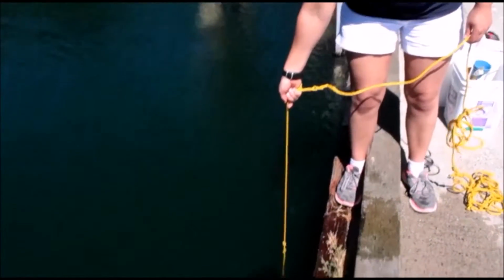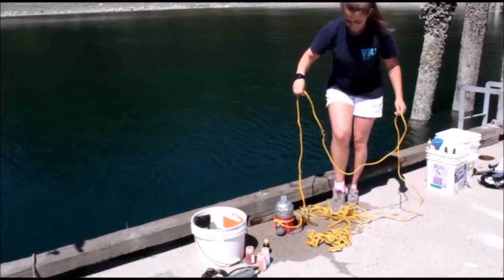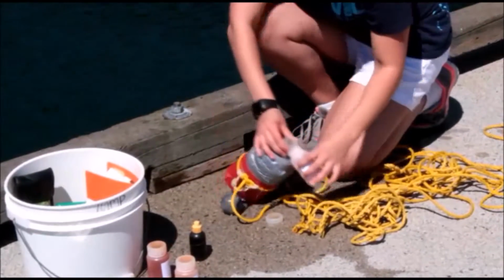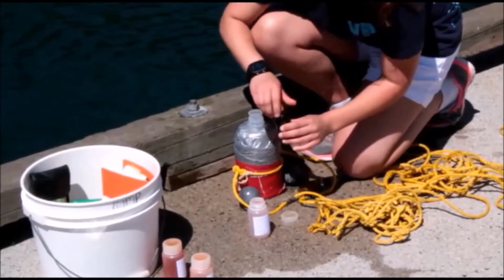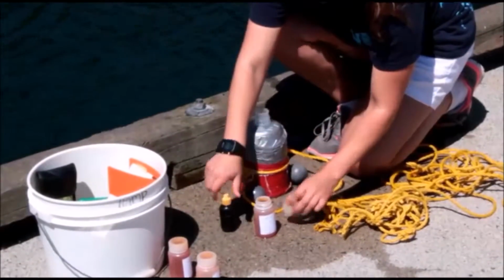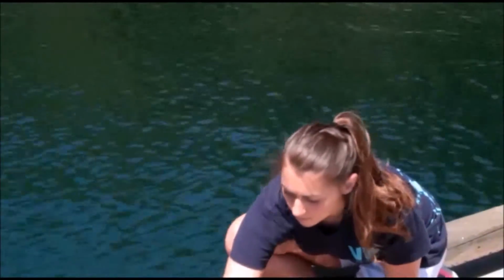You can also wait till the bubbles come to the surface from the air that was in the bottle when it was corked. Here they are. And then bring the sample back up. Rinse the sample bottle. Check and make sure that's the 5 meter one. And then fill it up. Eight to 15 drops of Lugol's. Invert gently to mix. Check the color. And then you can move on to the next.